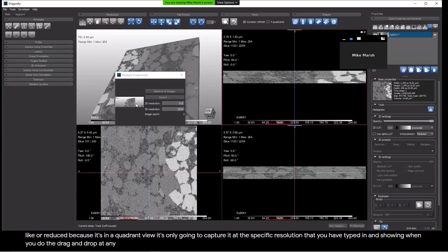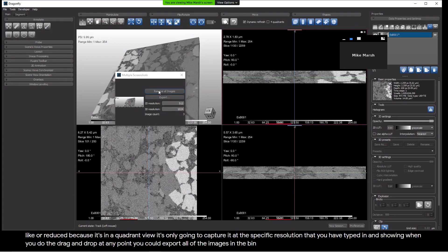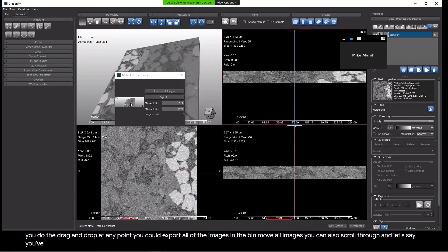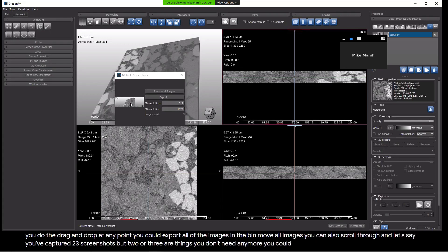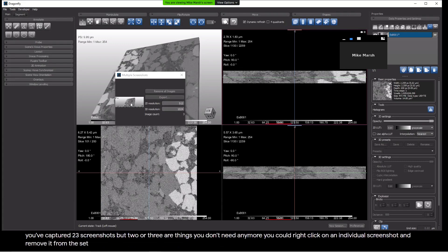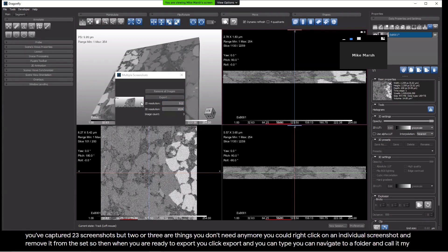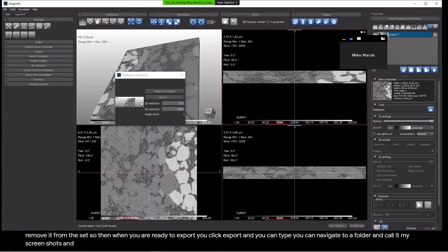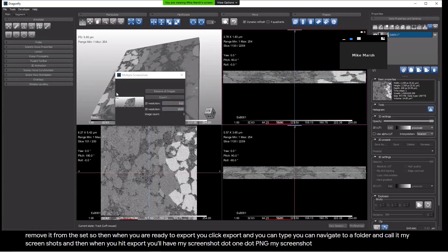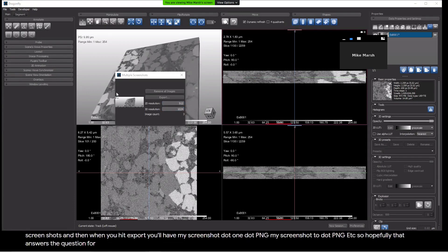It's only going to capture it at the specific resolution that you have typed in. At any point, you could export all of the images in the bin, or you could clear all of the images in the bin by remove all images. You can also scroll through, and let's say you've captured 23 screenshots, but two or three are things you don't need anymore. You could right-click on an individual screenshot and remove it from the set. So then when you are ready to export, you click export, and you can navigate to a folder and call it My Screenshots, and then when you hit export, you'll have myscreenshot.1.png, myscreenshot.2.png, et cetera. So hopefully that answers the question for those of you that couldn't hear the sound the first time through.